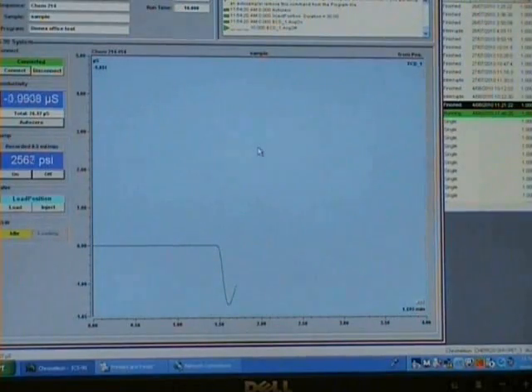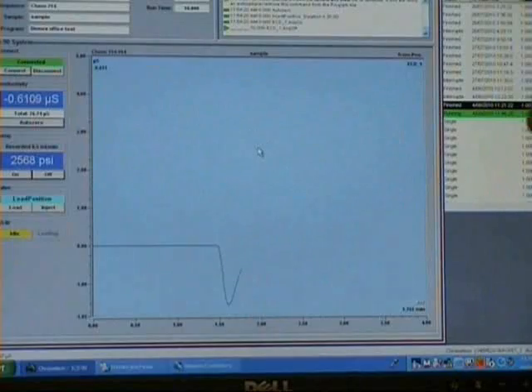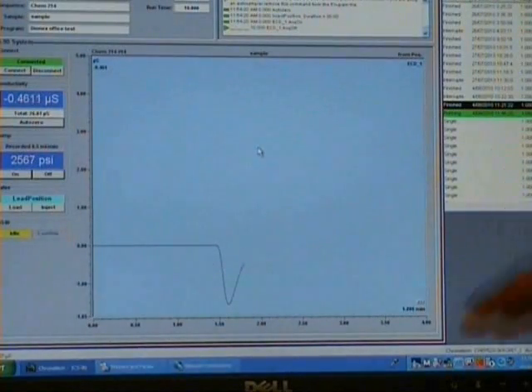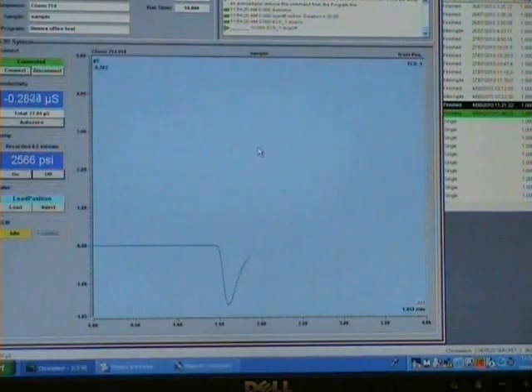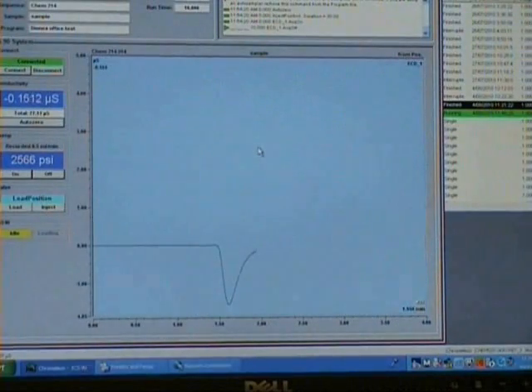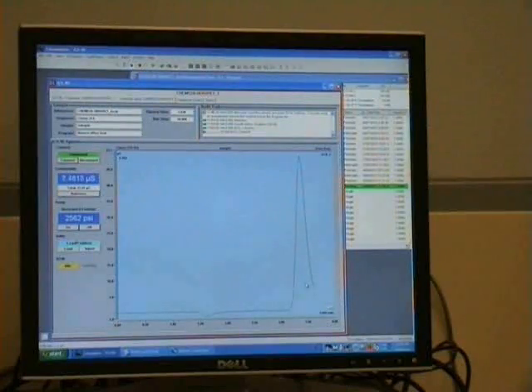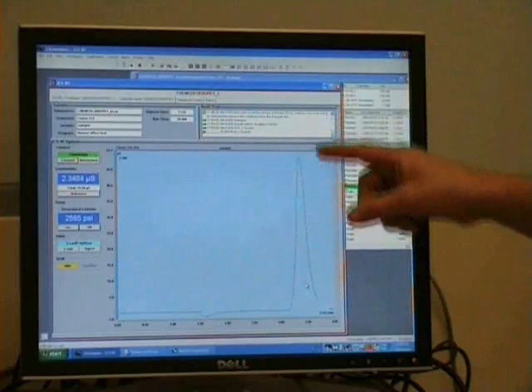While the sample is running, you will notice that a small peak will appear in a dipping fashion before the other analyte peaks come into play. This is generally from the solvent our analyte is dissolved in — in this case, water. It has a lower peak because it has a lower conductivity than the mobile phase passing through the system. When an analyte passes through the stationary phase, it will come out at the detector and appears on the screen as a prominent peak.